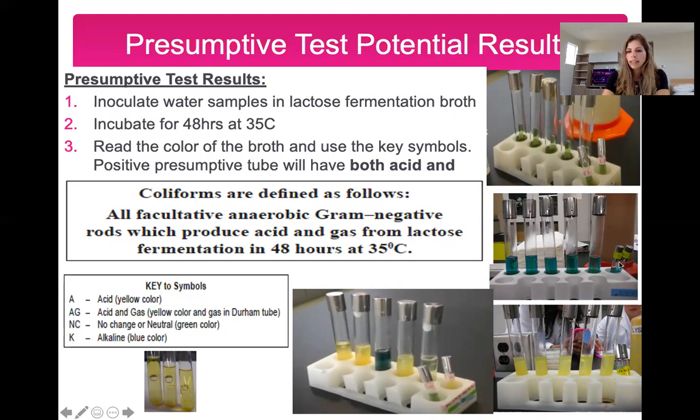So if I were to look at these tubes, this is the starting point. This is what lactose broth looks like before you add your water to it. Then you add your water to it and you could get many different results. So let's say these are 3 different water samples. These all turned blue, so the symbol for them is K.